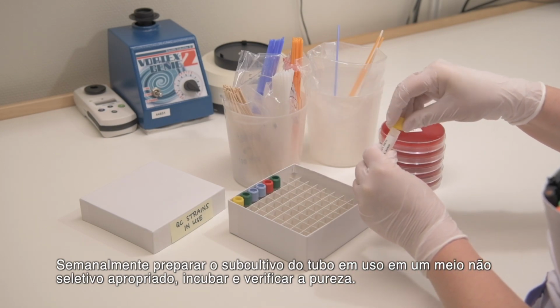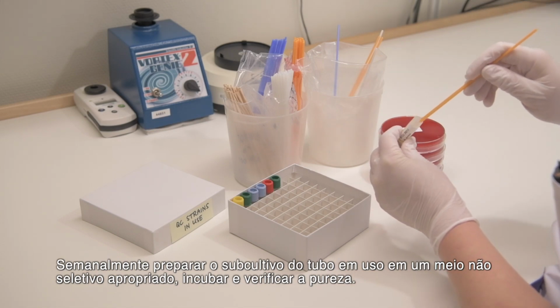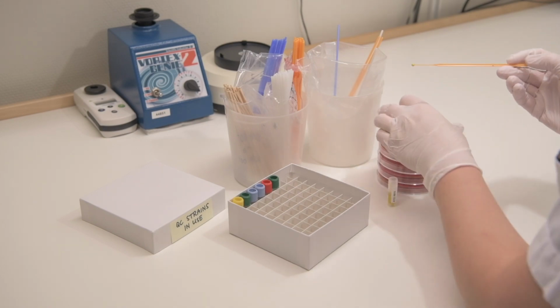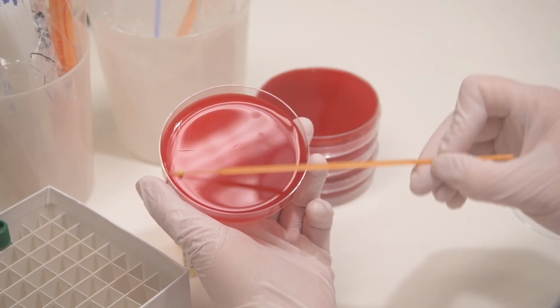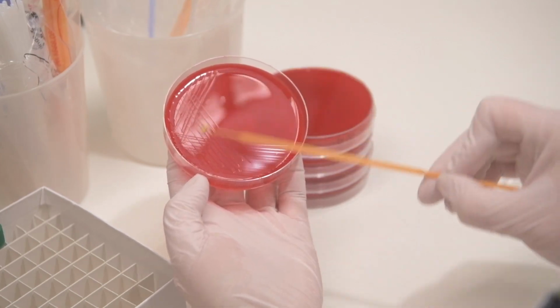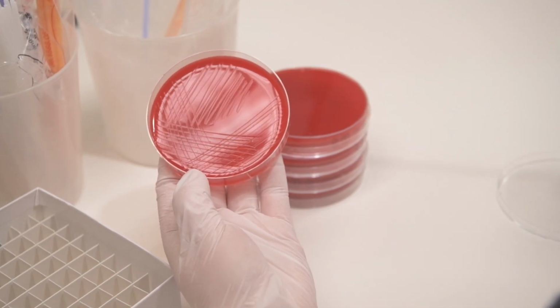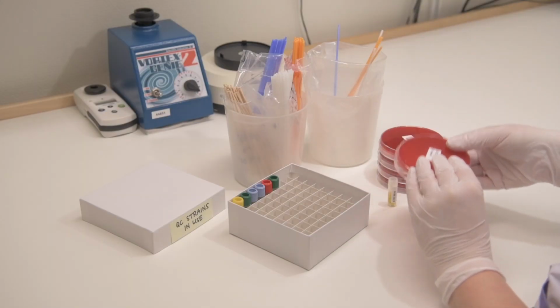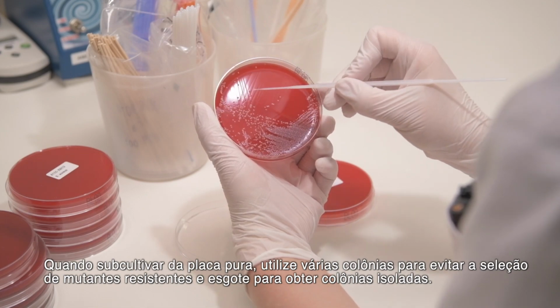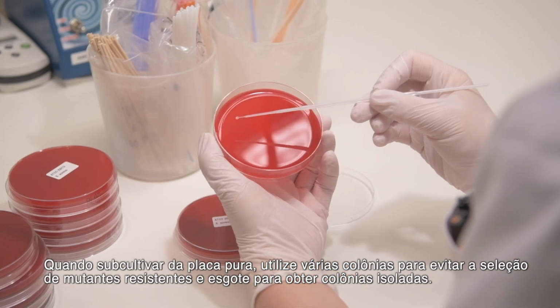Once every week, prepare a subculture from the in-use vial onto appropriate non-selective media, incubate and check for purity. When subculturing from the purity plate, pick several colonies to avoid selecting a mutant and streak to obtain isolated colonies.